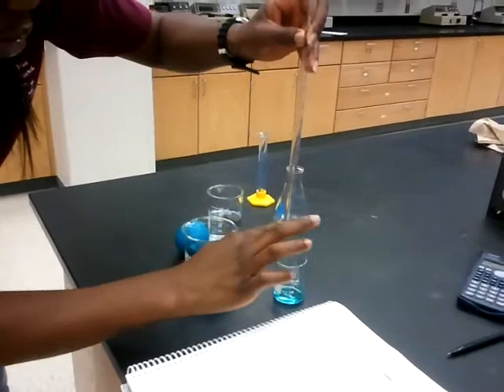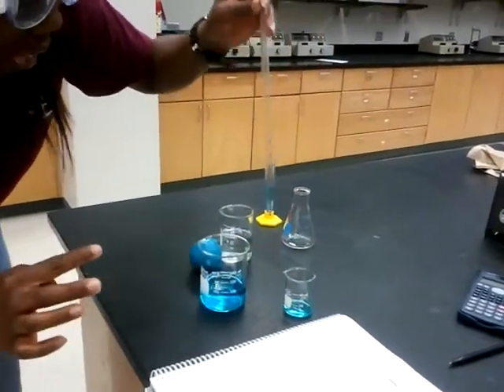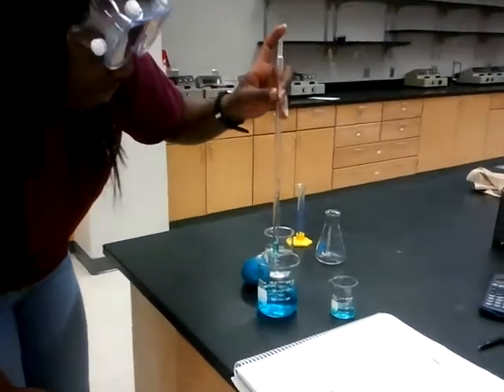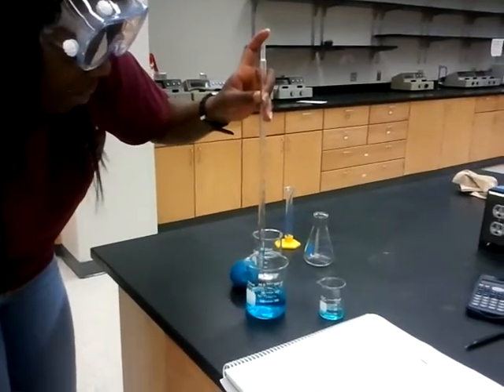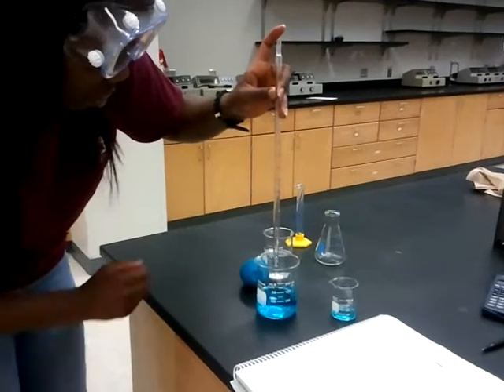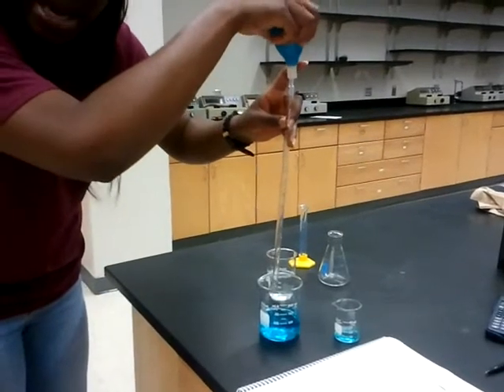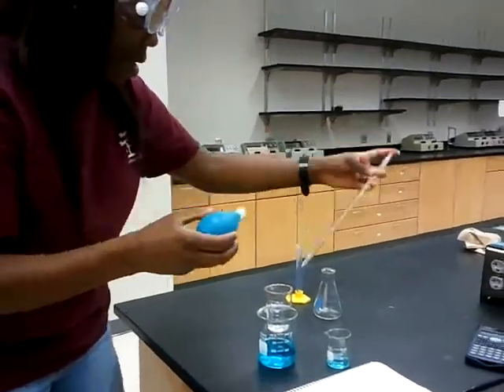There we go. So we'll make sure our meniscus also stops at the 10 mark. Okay? And then we release the liquid back into our beaker. And if needed, you can take your bulb and squeeze all the excess liquid out of the pipette.